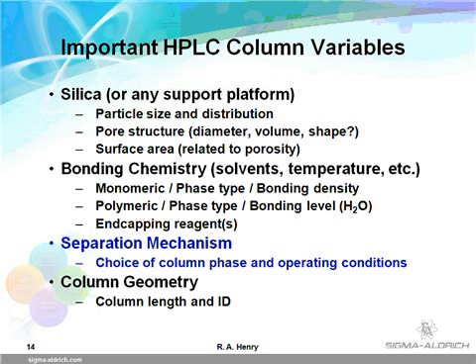Two main types of reagents include monofunctional, where 1 mole of reagent reacts with 1 mole of silanol, and polyfunctional, where 1 mole of reagent can react with more than 1 mole of silanol and also another mole of reagent, depending on moisture conditions. These phases are called monomeric and polymeric, respectively.